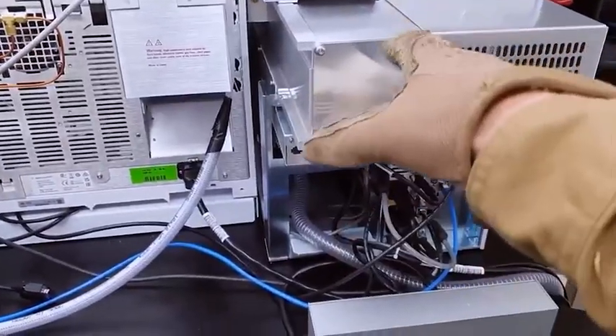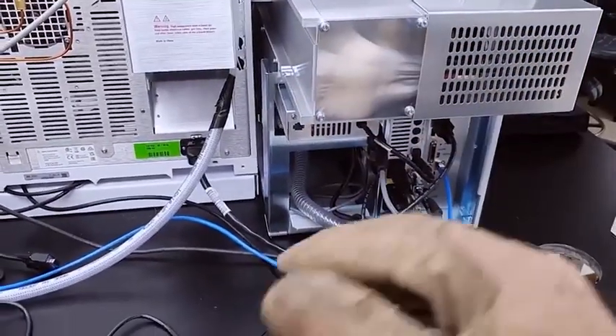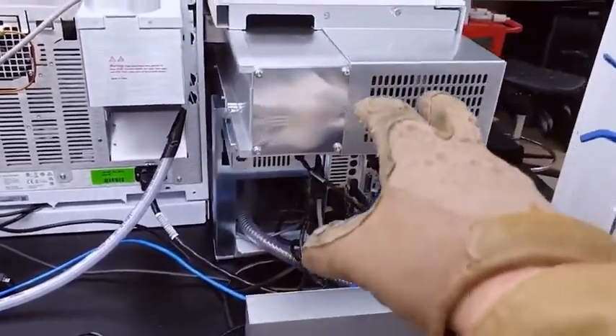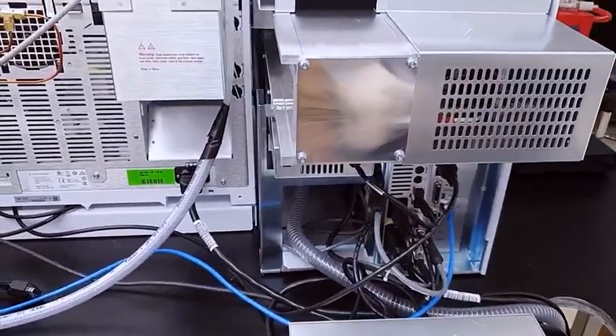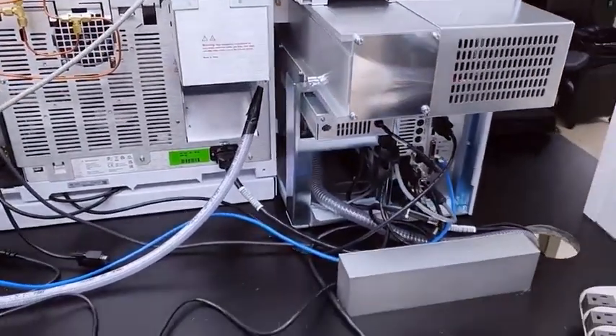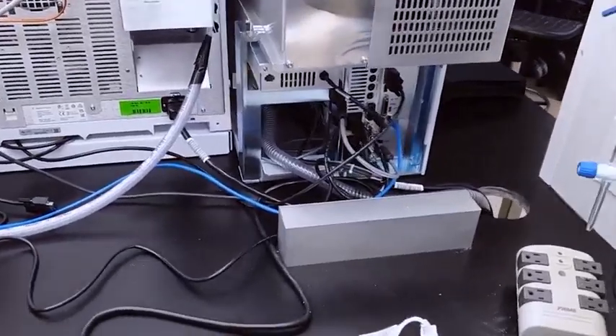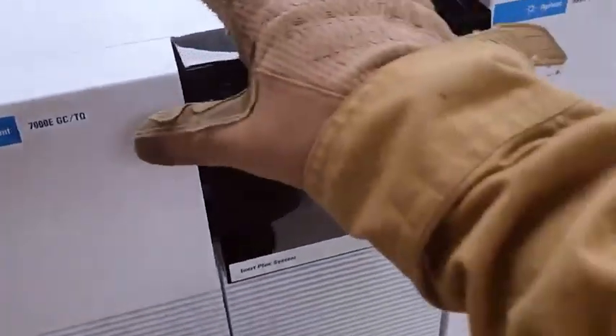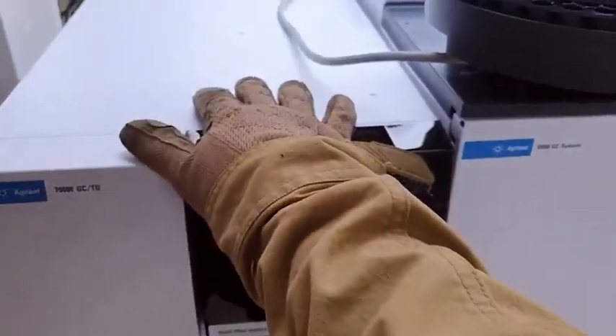The gas stream is sent to the mass spec, which has a quadrupole — actually this is a triple quad mass spec. I know it's so small you can't believe it, but it's actually a triple quad mass spec. In essence I believe it's got two quadrupoles and a collision cell, but I need to double check that — I'll know more once I get into using it. It's amazing that they can put a triple quad mass spec in something this small.